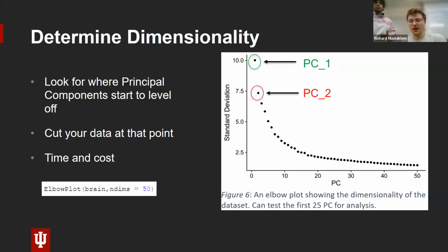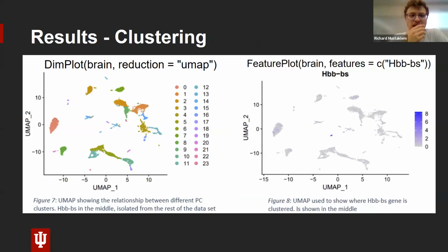Sweet. Thank you. Okay, so now we're going to plot our UMAP. This is something that you'll see commonly in single cell. They call these UMAPs. All it is, it's literally just taking your genes and putting them together and clustering them together. It uses something called k-means clustering. So k-means is just a type of clustering. I don't need to get into the specifics of k-means, but there's many types of clusterings and you can even change it in Seurat if you wanted to. But most people just use k-means because that's kind of the standard that's been set. But if you have a reason to change, you can.